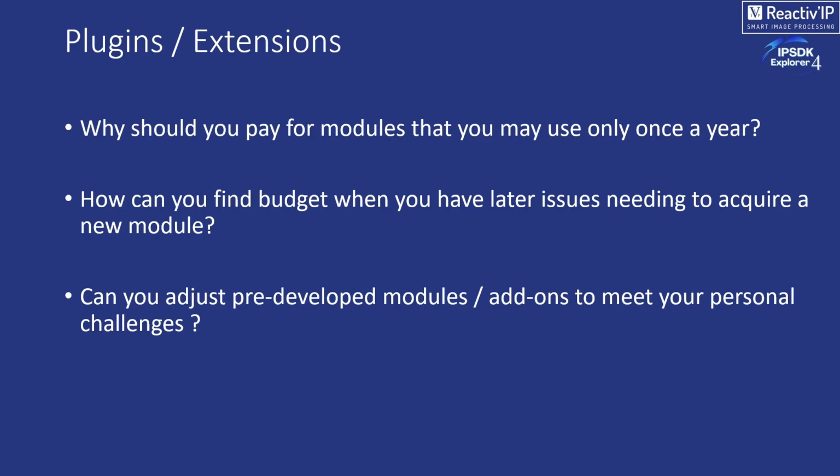Another thing, when you purchase a module, you also have extra cost on the maintenance. So that's another axis, still about money. And if you didn't purchase your module from the beginning, and if you have a new need that arrives 2 or 3 years after purchasing the license, the software editor will tell you, okay, you have to purchase a module.